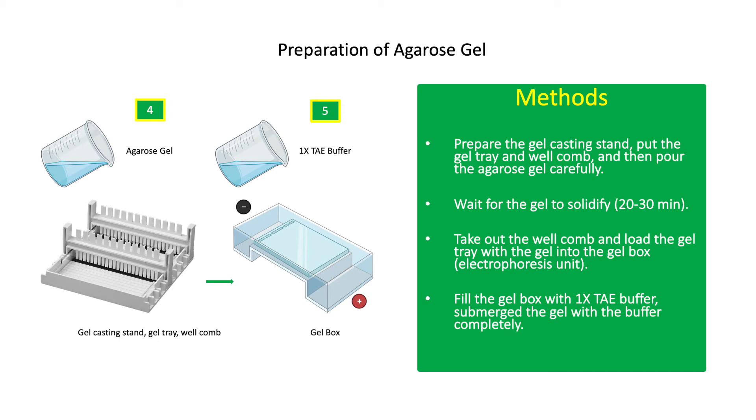Avoid making bubbles when pouring the agarose gel. If there are visible bubbles in the gel, you can use a pipette tip to prick them. If there are bubbles or air pockets in the gel, it will interfere with the migration of the DNA during electrophoresis. Wait for the gel to solidify, about 20 to 30 minutes. Then take out the well comb and load the gel tray with the gel into the gel box. Fill the gel box with 1X TAE buffer and submerge the gel completely.